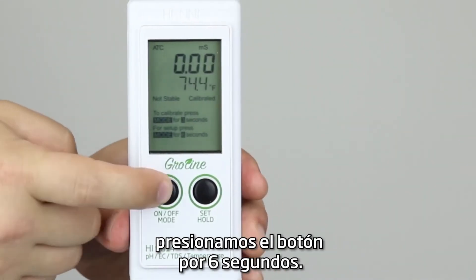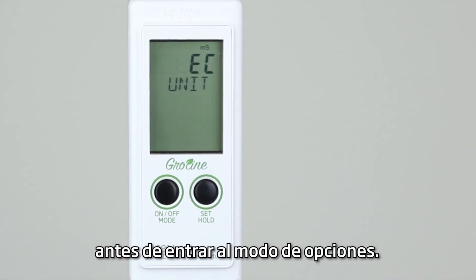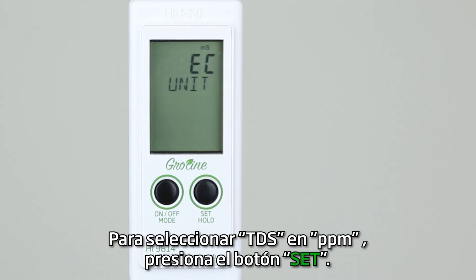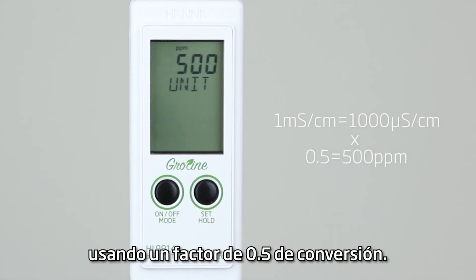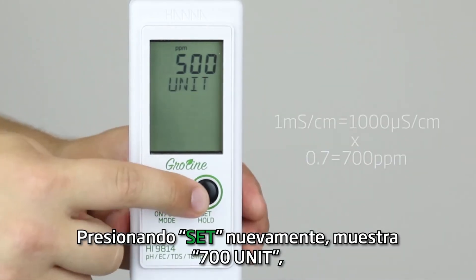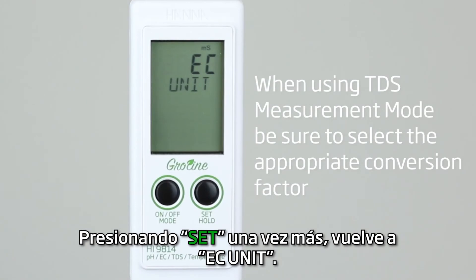Modify the current setting by pressing and holding the mode button for six seconds. OFF and CAL messages will be displayed before entering setup mode. Currently, the meter is set to display concentration as EC. To select TDS in parts per million, press the set button. 500 unit is then displayed for concentration readings using a 0.5 conversion factor. Pressing set again shows 700 unit for a 0.7 conversion factor. Pressing set again cycles the measurement option back to EC unit.